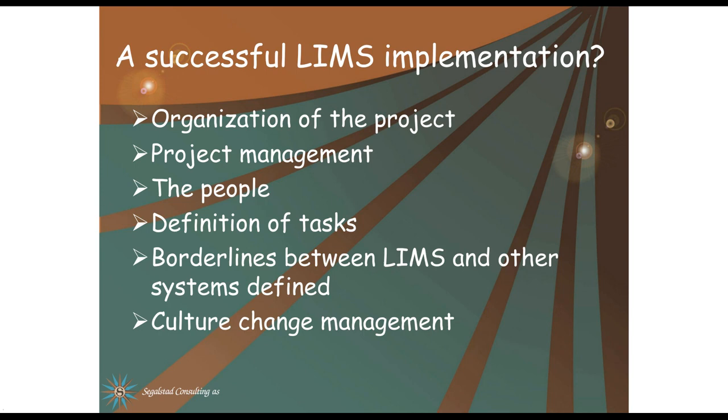I took part in the LIMS conferences many years ago. What we heard was that more than 50% of the projects failed. LIMS was not good for them. But actually, that was not the root cause. I've found that there are two reasons why LIMS projects fail. One, there's no user requirement specification. Remember Alice in Wonderland? Two, the management was not involved in this new toy for the lab, which I've heard it being expressed as.